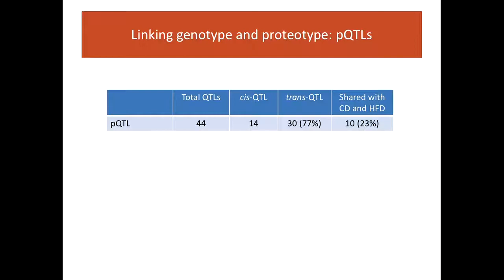I don't want to show a lot of data, because I want to get back to the proteomic landscape. This is actually a proteomic experiment, and here he observed results by doing limited measurements. He has now repeated this with SWATH MS, but these are data from an earlier study with SRM, but the picture is the same, it's just lower numbers.